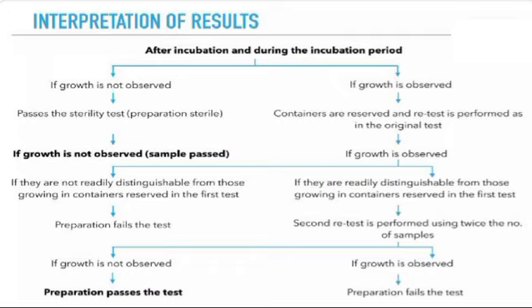Interpretation of results after incubation and during the incubation period. If growth is not observed, the preparation passes the sterility test. Preparation sterile: if growth is not observed, sample passed. Container: if growth is observed, containers are reserved and a retest is performed as in the original test.